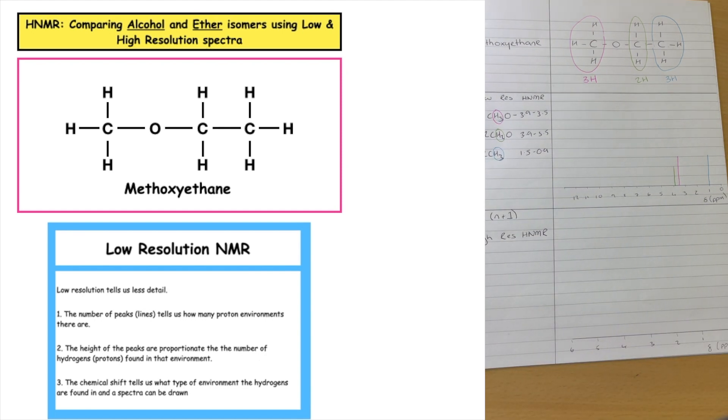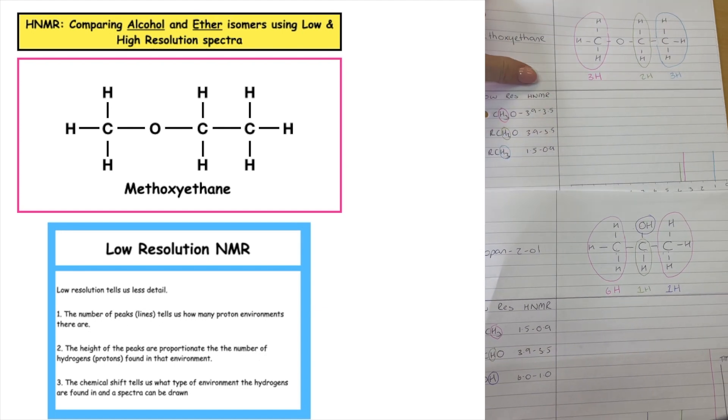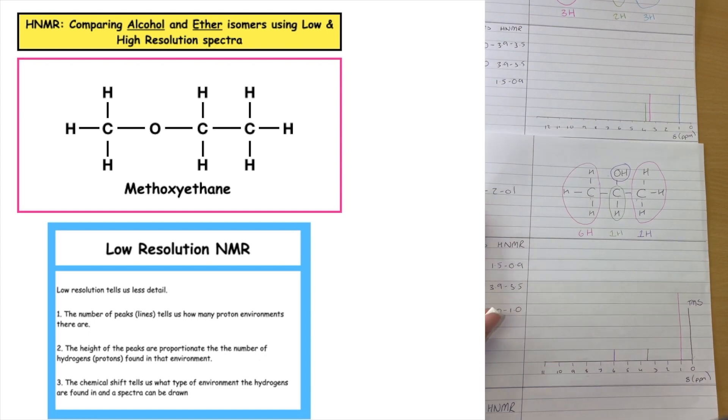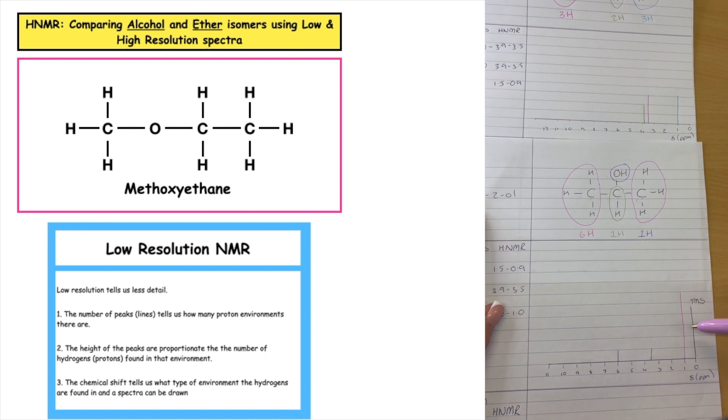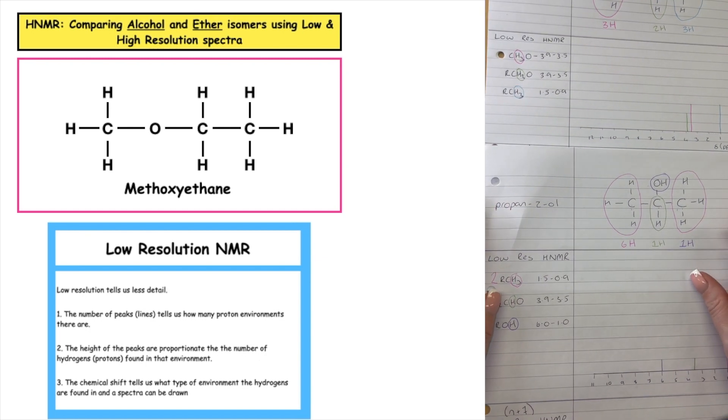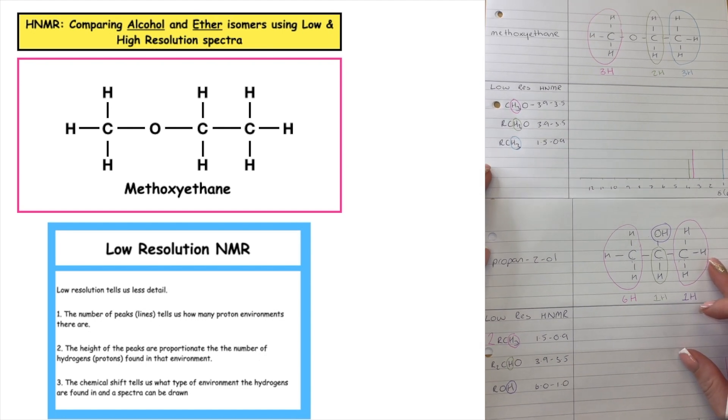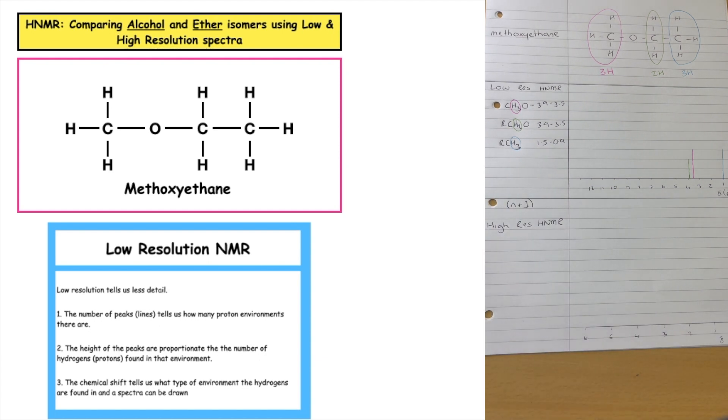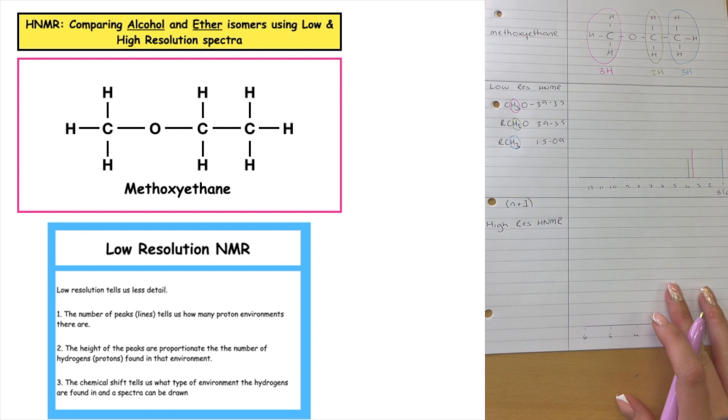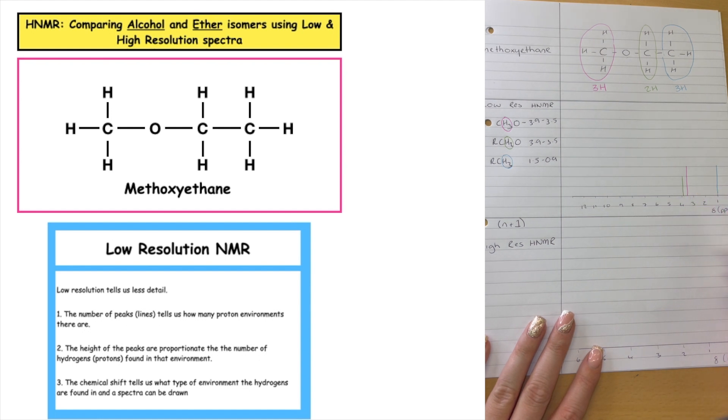So if I compare that back to propane-2-ol, what we can see is that the number of peaks, although we've got the same number of peaks, the chemical shifts are different for those, and the height of the peaks are different as well. And that's due to the number of hydrogens that can be found in that proton environment. So we could probably identify between methoxyethane and propane-2-ol just from the low-resolution HNMR. But what we're going to do to confirm that is we're going to then look at the high-resolution HNMR when we're looking at the splitting of each of our environments.